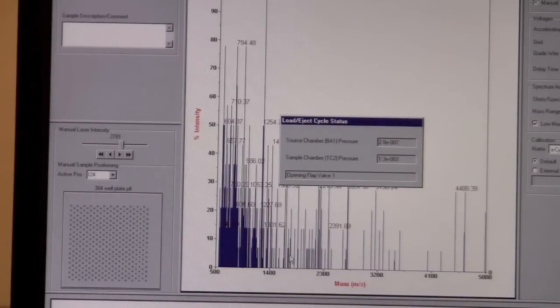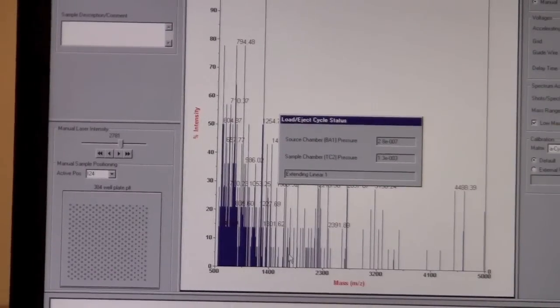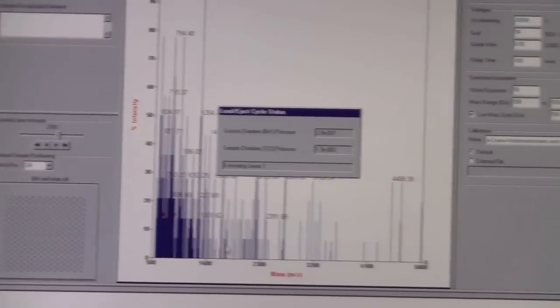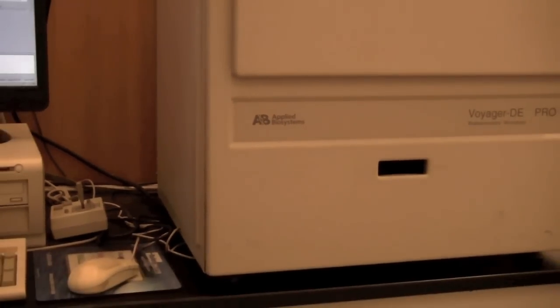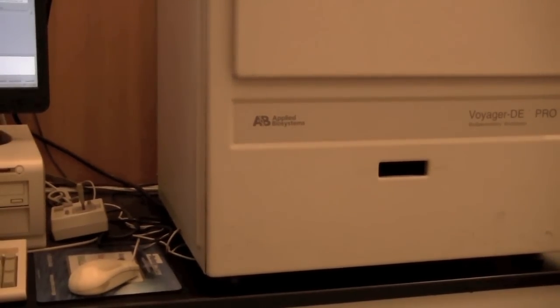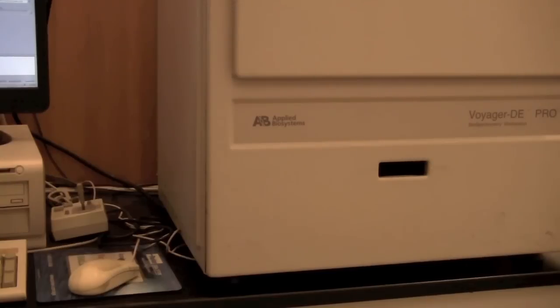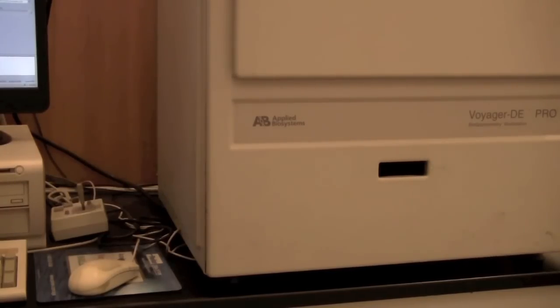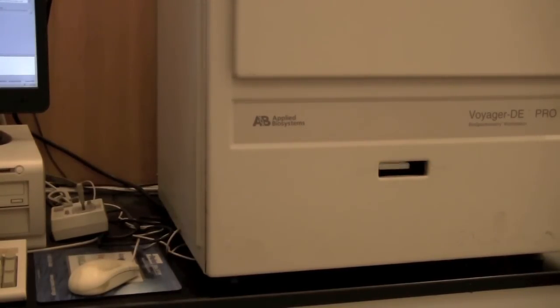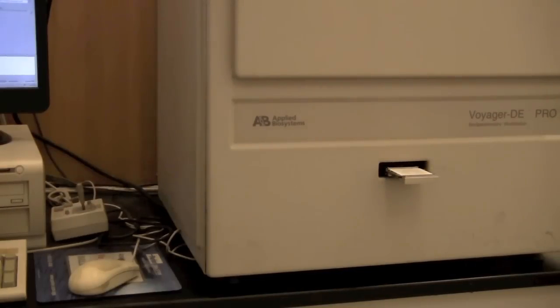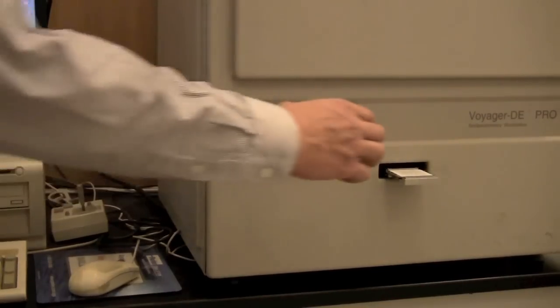The sample is ready to eject, so we can go back and watch it extend the arm ejecting the sample plate. Make sure not to touch it before it's extended the sample plate completely. After it's extended the sample plate, then you can take your plate out.